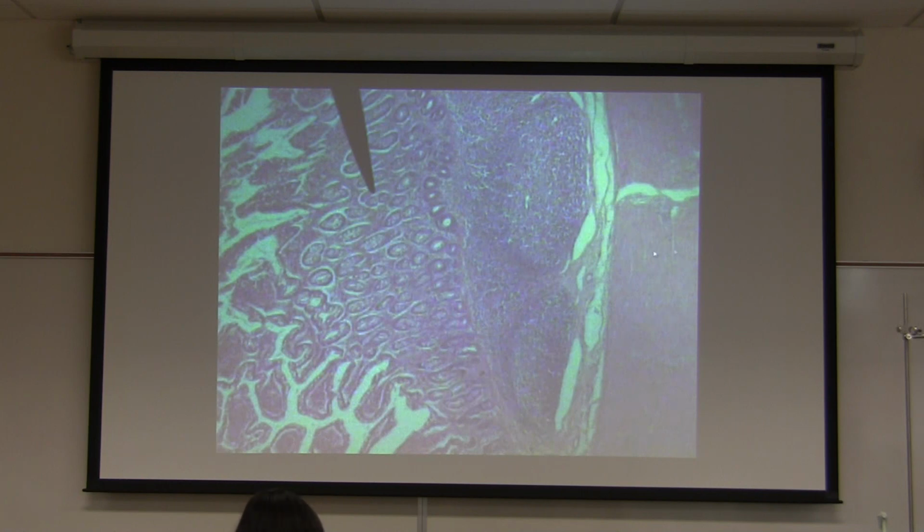This is the muscularis layer. You see the circular smooth muscle, but you don't see the longitudinal muscles that are supposed to be right here. They're outside. Longitudinal muscles are outside, like a little round thing, another round thing, another round thing. Look at your slides. You should be able to find them. You know what they already are. Okay, so what else do I have to know here? Probably nothing at this magnification. Well, I might. You never know.